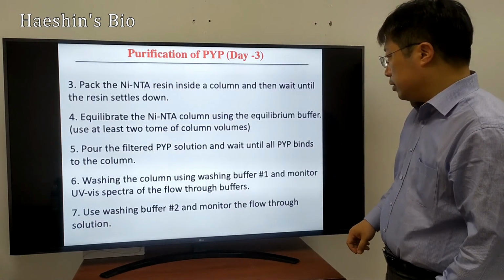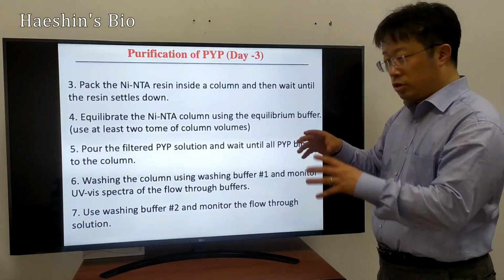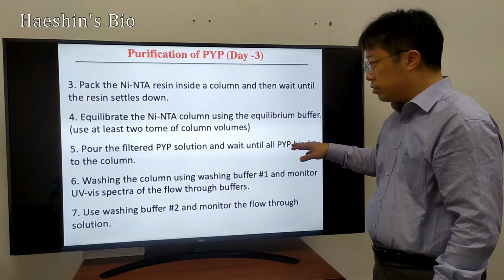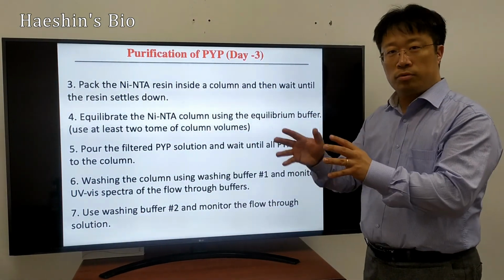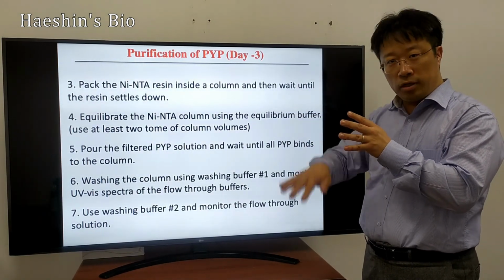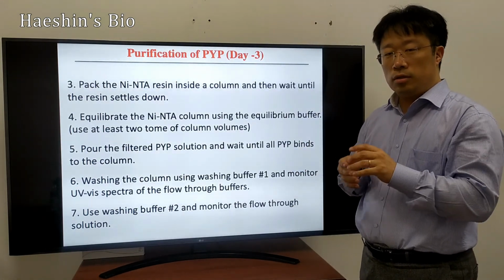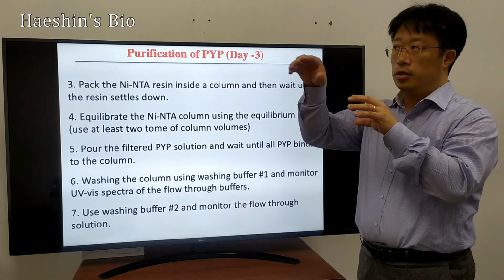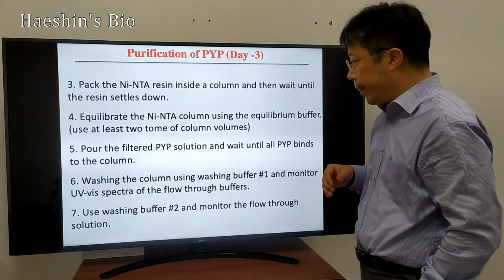And then now pour the PYP solution. It's now a mixture of the protein, and then all proteins bind, and then simply washing, because our target protein is bound, and the protein without the tag will be eluted automatically, because this is a histidine column system. But still, the histidine column has a charge, because nickel is positively charged, and then some proteins with a negative charge will bind to it, which is possible.